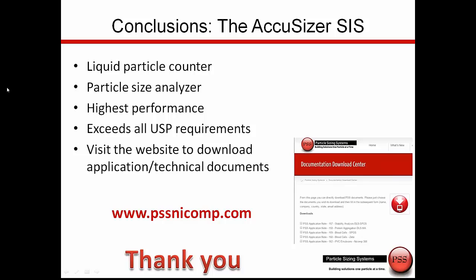The AccuSizer SIS system is a liquid particle counter and a powerful particle size analyzer. It's the highest performance system in terms of dynamic range, accuracy, precision, and being able to measure very small sample volumes. It exceeds all USP requirements and with a single system can be used both for pass-fail quality control testing and as a research tool.